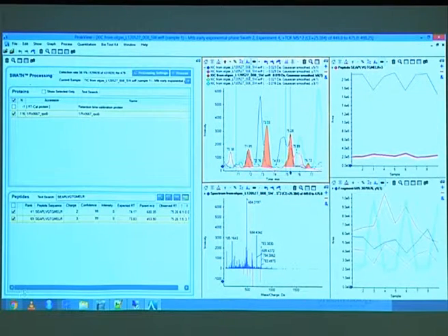so they're fine. Like this, what I did with the charge states, you can do that in order to gain some confidence if one charge state is very well identified and the other charge state is not that well identified. Other software like OpenSWATH and SWATHprophet give you the IDs per window that you acquired.